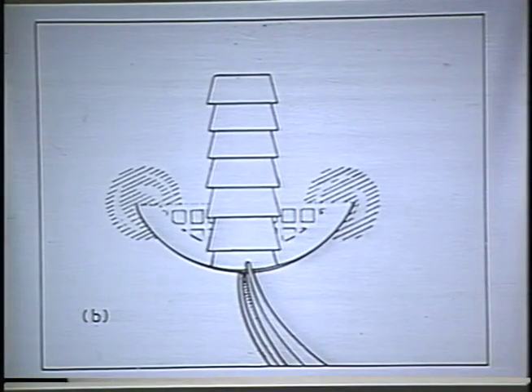The standard method for loading the sections onto a grid is to just dip the grid in the boat at about a 45-degree angle, and then I would touch the last section to the grid and slowly pull the grid out, and hopefully the ribbon will adhere to it. If you're doing a series of ribbons, you can put the ribbons together and form a platform, and then try and load the whole platform at a time. That takes time, and sometimes it doesn't work. Sometimes the ribbons get out of order, but there's a way to deal with that.